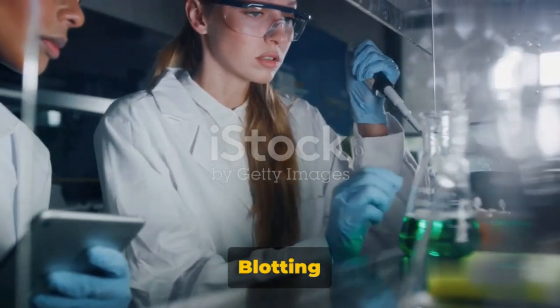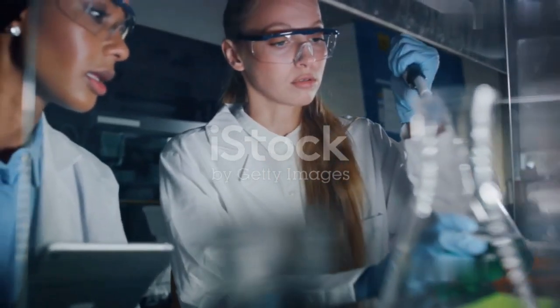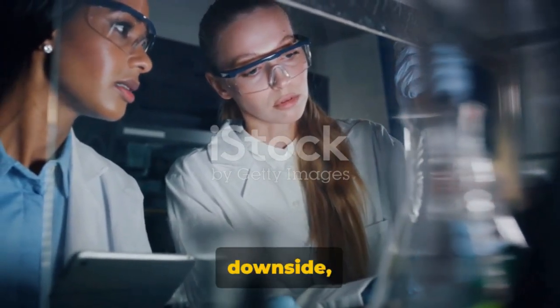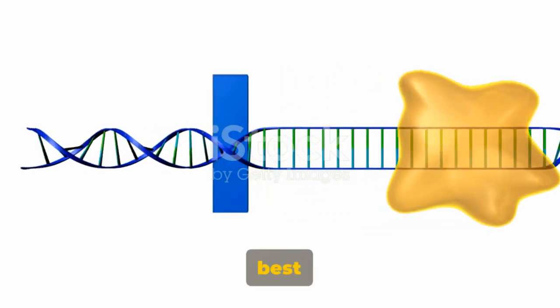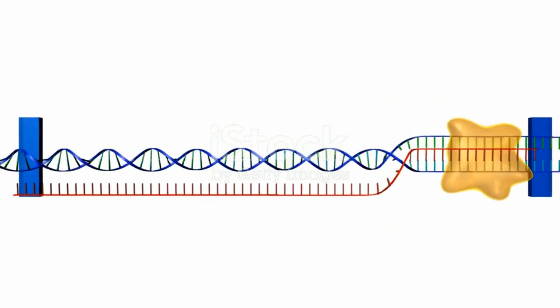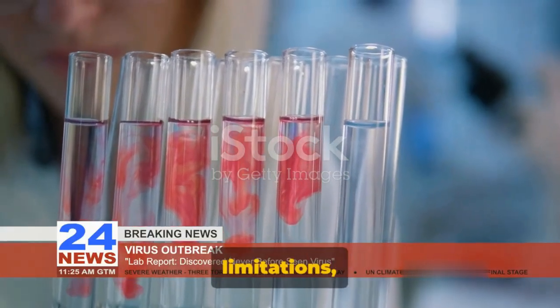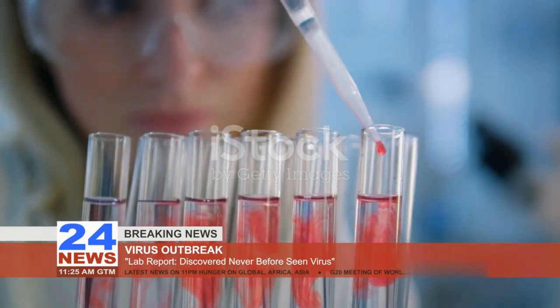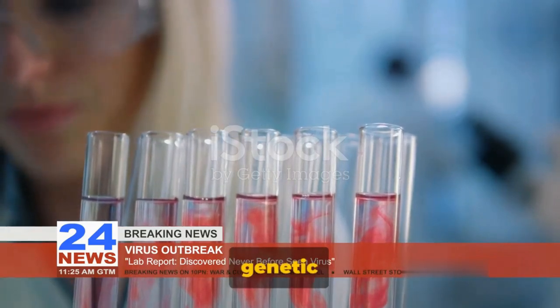Now, northern blotting has its pros and cons. On the one hand, it's simple and cost-effective. It doesn't require any fancy equipment or expensive reagents. On the downside, it's time-consuming and has low throughput. This means it's not the best choice if you're in a hurry or need to analyze a large number of samples. But remember, every method has its place. Despite its limitations, northern blotting is a reliable method for measuring gene expression. It stood the test of time and remains a valuable tool in the toolbox of genetic researchers.